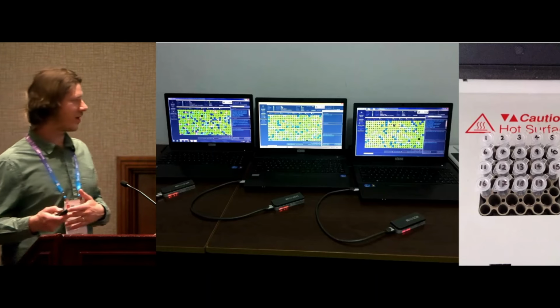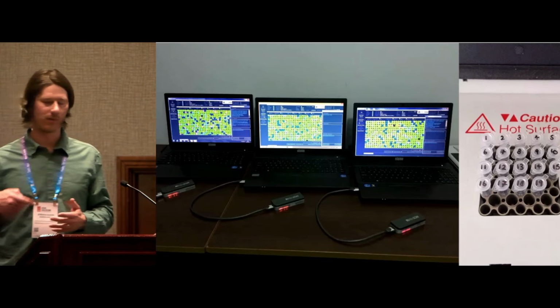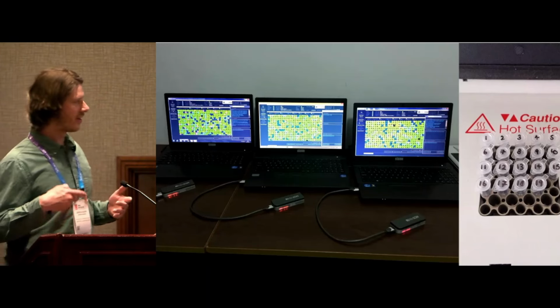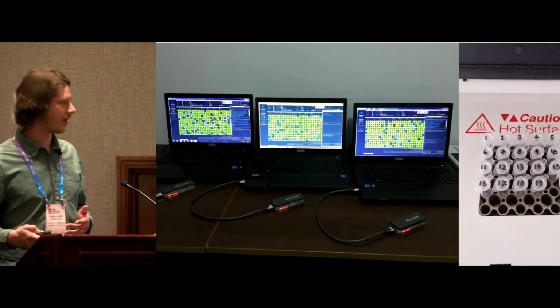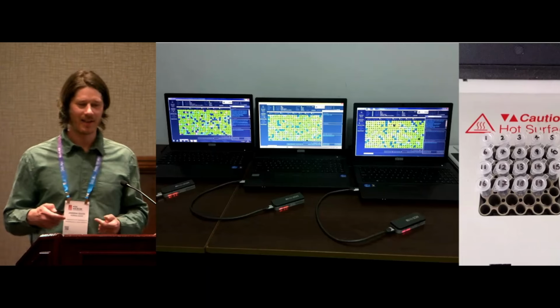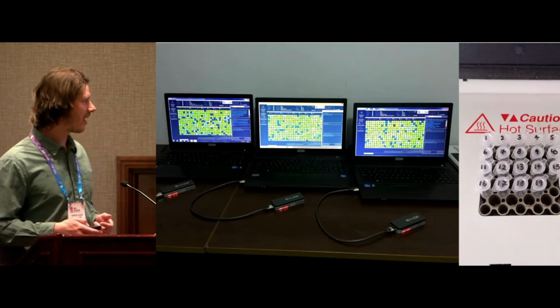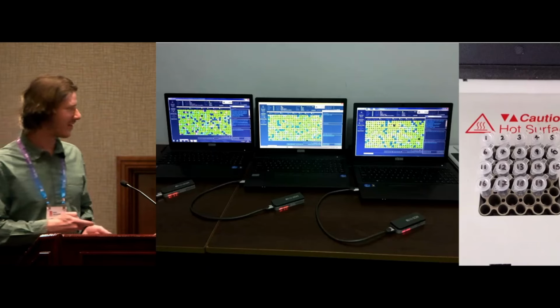But the point of what I wanted to show here is, if you look on the right, that's the PCR run. This was singleplex amplicons. We had 19 amplicons in this experiment to generate coverage, tiling amplicons, singleplex RT-PCR reactions tiling the Ebola genome, and then one flow cell per sample. So we were basically at this time using pretty much the entire supply of MinION flow cells to do this sequencing.